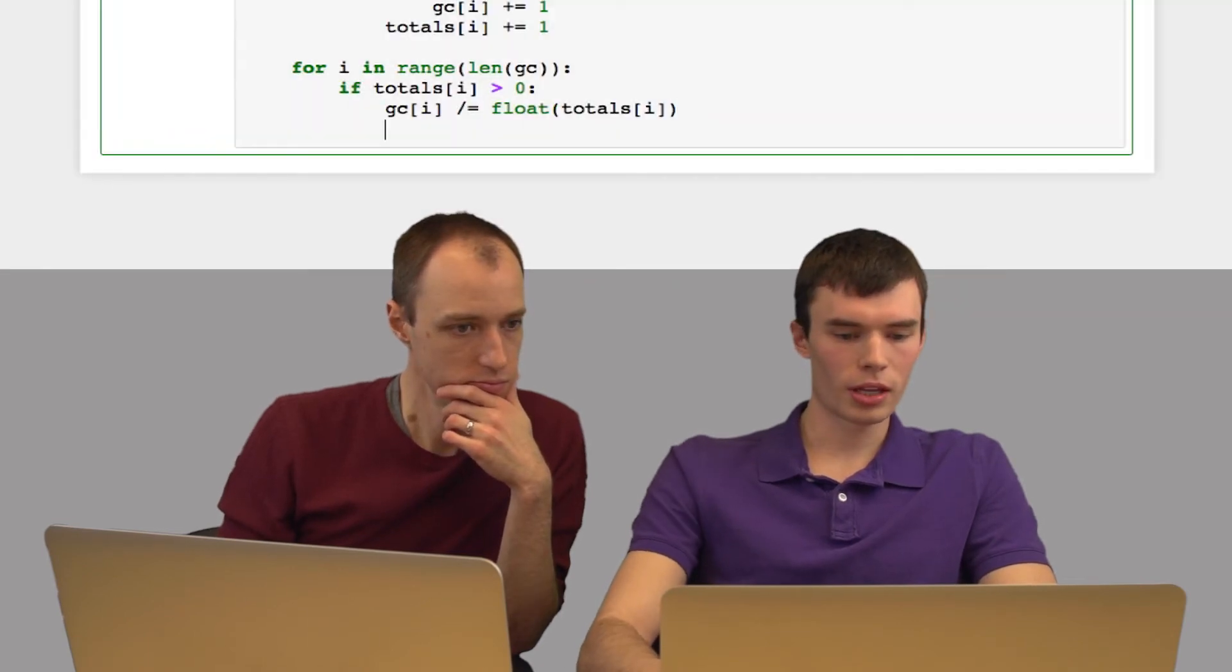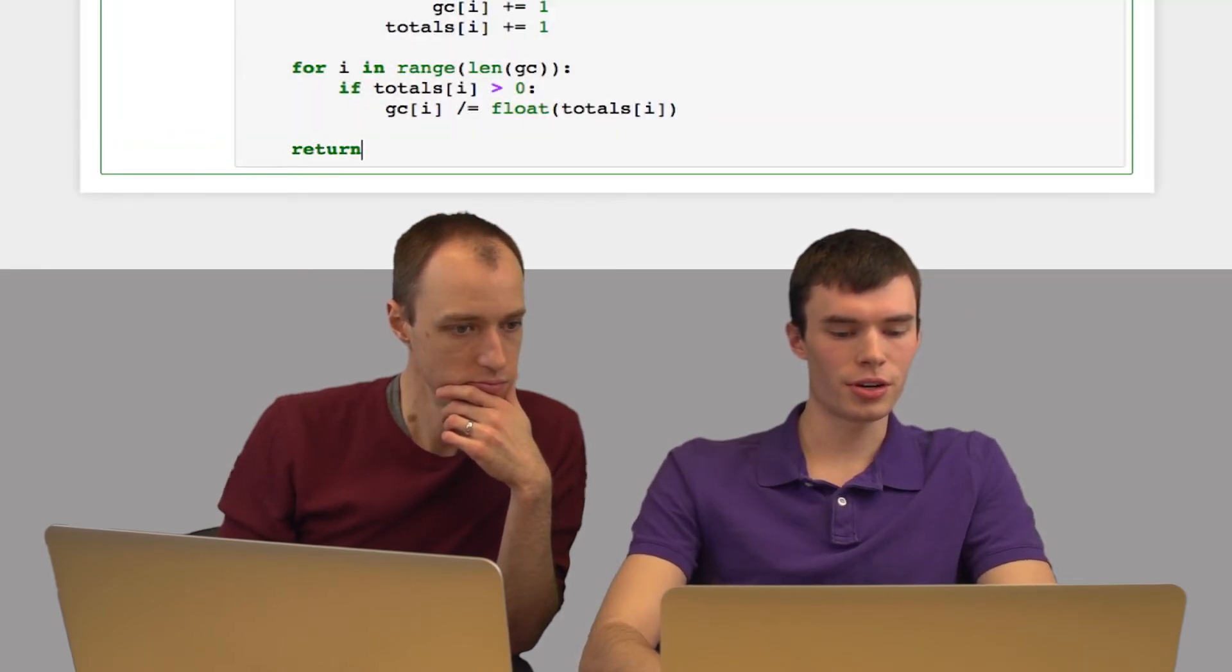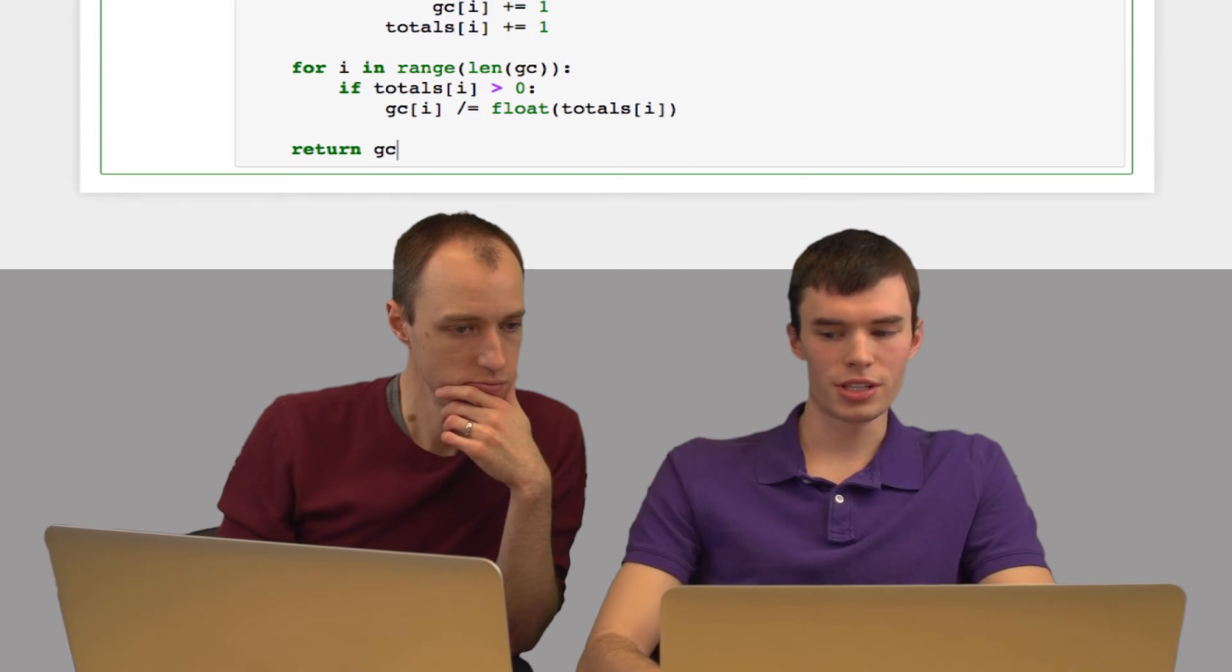One thing to be careful of: if totals[i] equals zero, I'll get a divide by zero error. So I only want to do this if totals[i] is greater than zero. Then when this is done, I return GC.